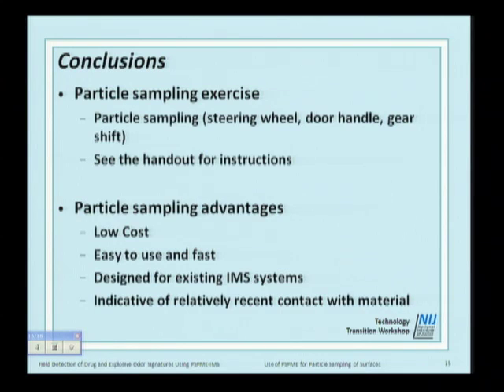So we're going to apply PSPME for particle sampling. We have other substrates that are provided by the manufacturers of the IMS instruments right now for particle sampling. You'll have an opportunity to use those. And then we're going to give you a series of exercises for both surface sampling in the laboratory, and then we're going to take you out to the warehouse where we have some vehicles where you're going to be doing some surface sampling of the vehicle.